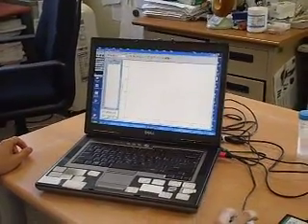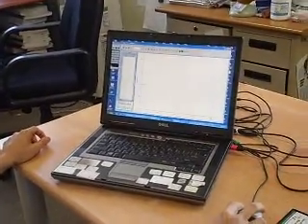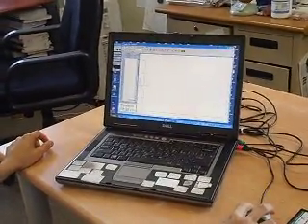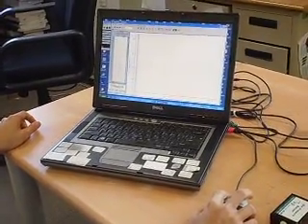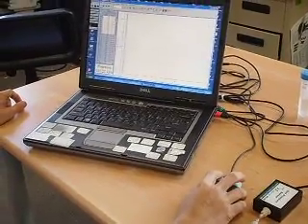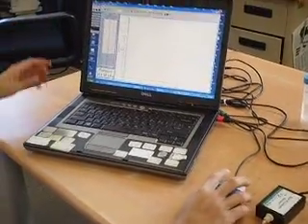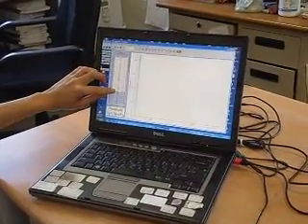So I'm going to use interval. Click on this interval here. Highlight this part, this region. So I'm going to check now for this. The first one I'm going to look for, this is important, is where the reaction starts. So at time, this is 101.